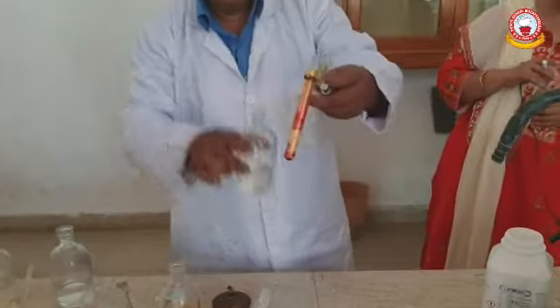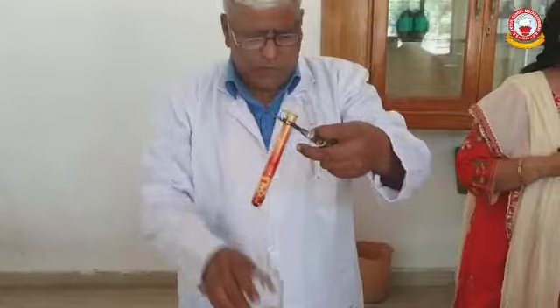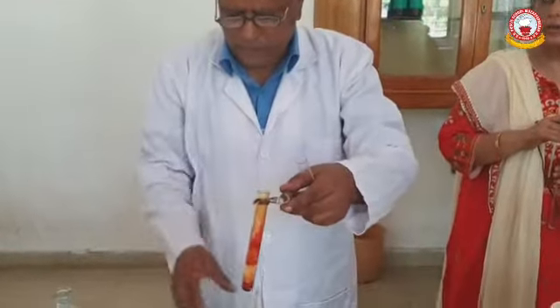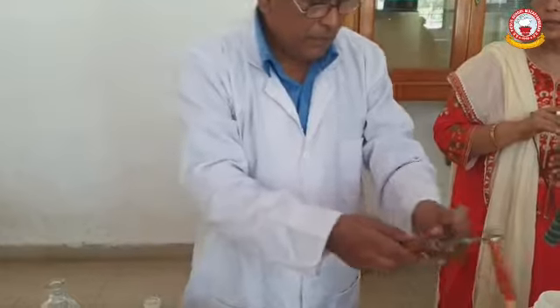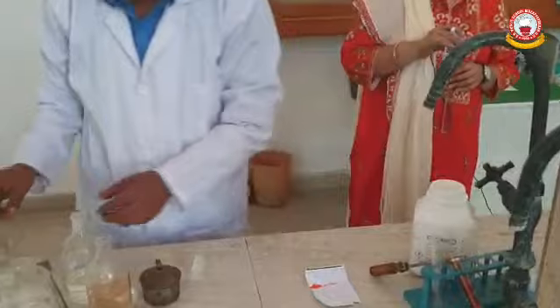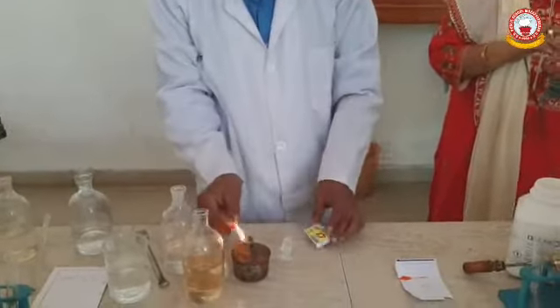Now we will keep another test tube ready which contains NaOH solution, and these vapors are allowed to pass through NaOH solution.